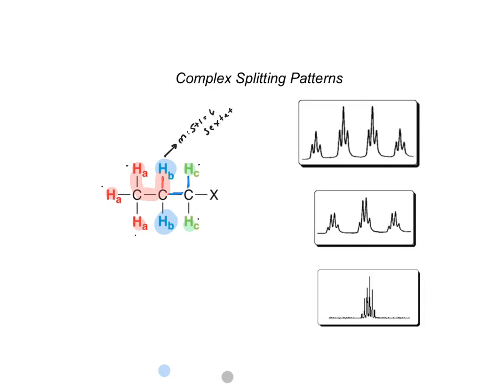Okay, so now, the thing about this is not exactly necessarily true. In reality, and you won't actually ever get into this until you get into really high order NMR spectroscopy, this assumption that we made isn't true because it's going to depend on the coupling constant, or the J value, of the two different interacting sets of protons, right? So we have two different J values that we can look at here. We've got what we're going to call JBC, and then we've got what we are going to call JAB.